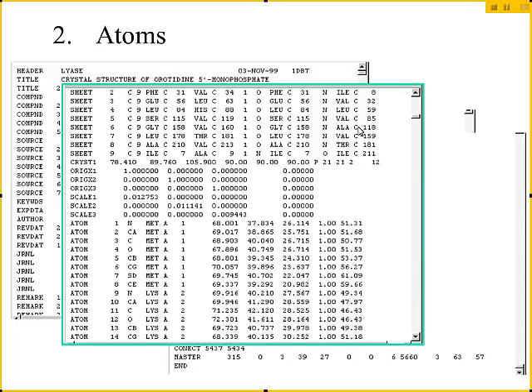Now, you do need to understand the naming convention of a protein amino acid. And so there's a backbone to the protein amino acid. That's N-CA-C-O. In the typical protein databank file format, that's at the beginning of the residue. And then comes the side chain.